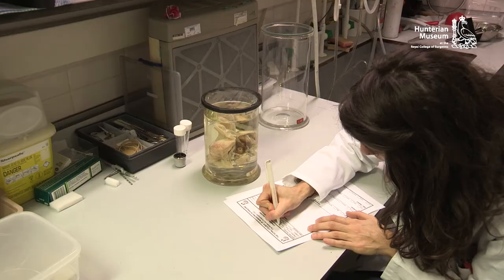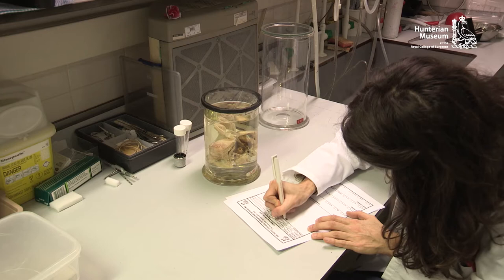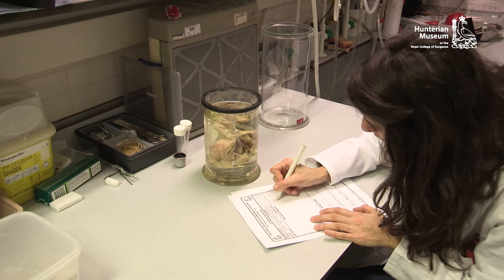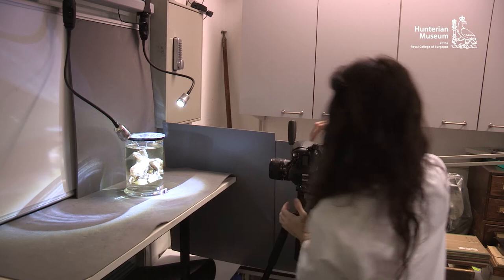The conservator will carry out a detailed condition assessment, noting the current condition of the preparation and considering any risks that might affect the specimen or staff whilst carrying out any conservation work. An action plan and a health and safety risk assessment can now be put into place to ensure the work is carried out safely. In addition to noting down comments and observations, it is very useful to take a series of digital photographs and make simple sketches if necessary.